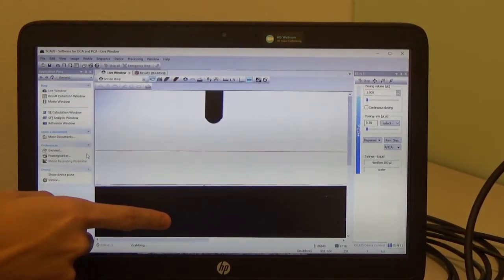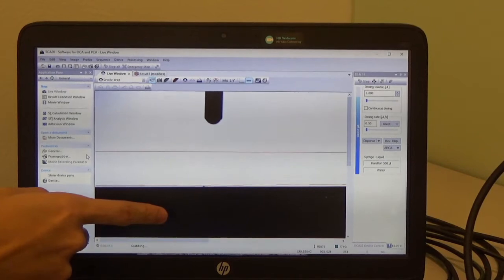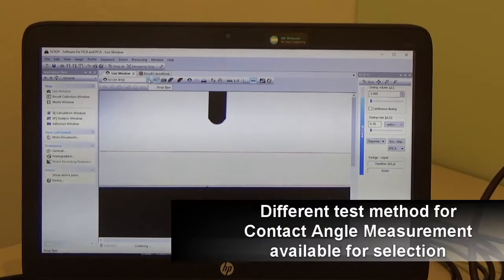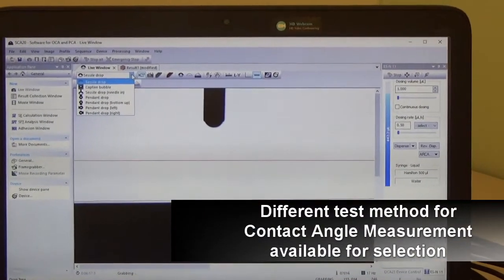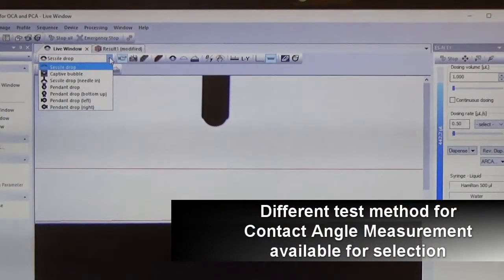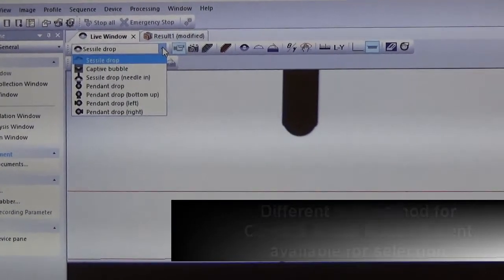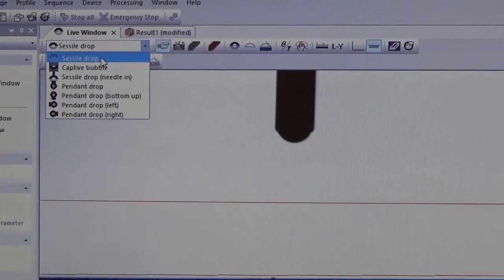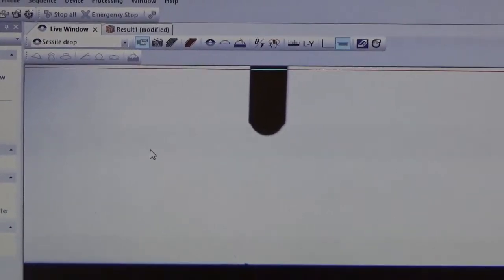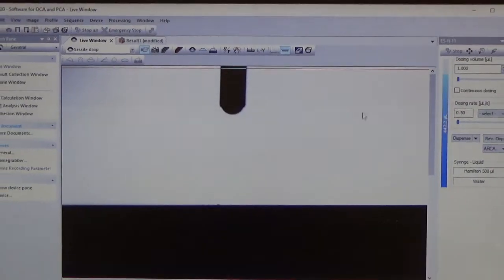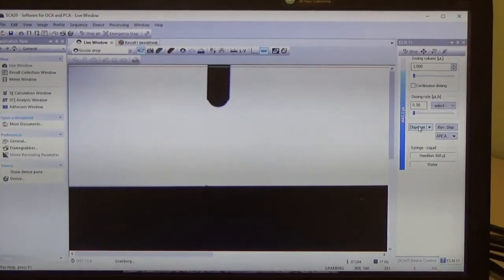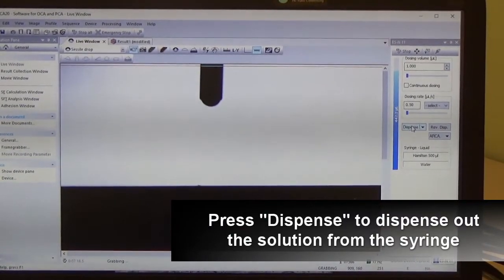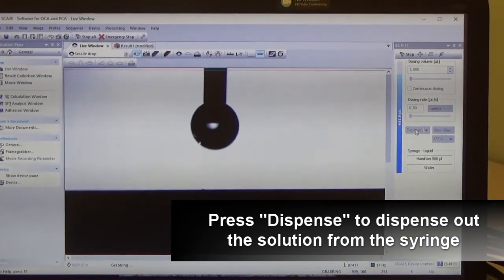The live window shows the substrate you are going to use. There are a few selections for different types of contact angle measurement methods. For this instance, we are using the sessile drop method. You then press the dispense button to dispense the water droplet from the syringe.